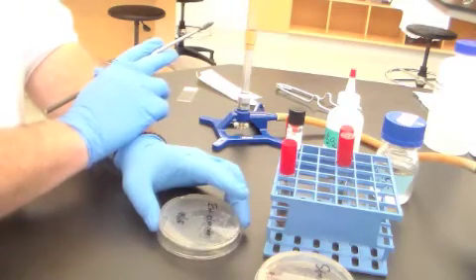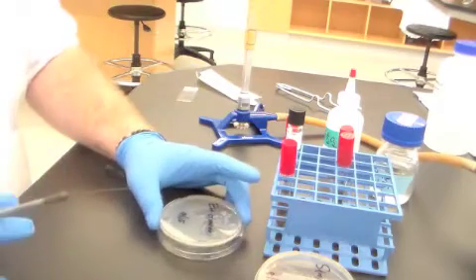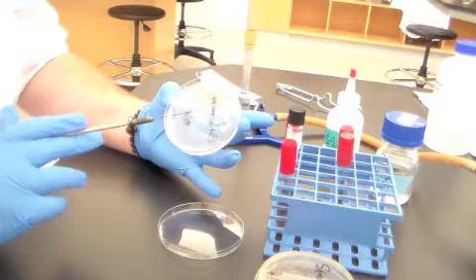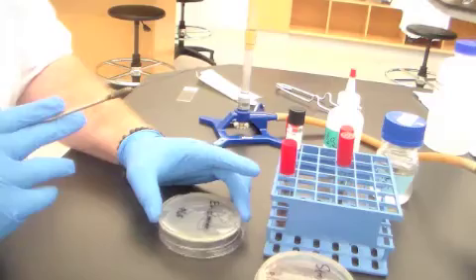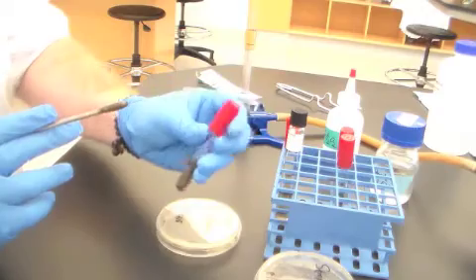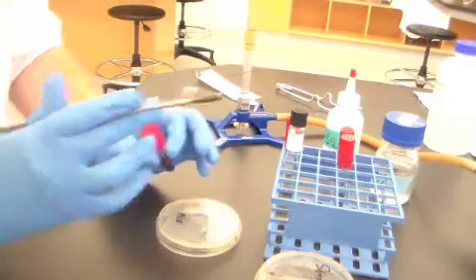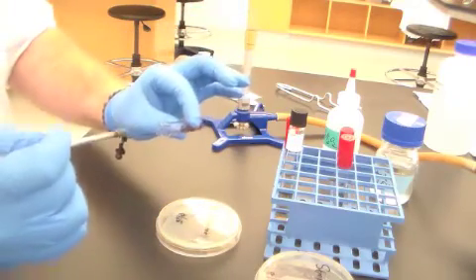I've sterilized my loop, as is dictated by great sterile technique. Once that's cooled slightly, perhaps I even quench it on an uninoculated portion of this medium. I'm going to touch a colony. This is a bacterium called Enterobacter cloacae. So this is an enteric bacterium. We can either inoculate, this is a broth that contains lysine. The PDF will actually explain better all of the components of this medium. But I'm just going to inoculate this with that single colony.